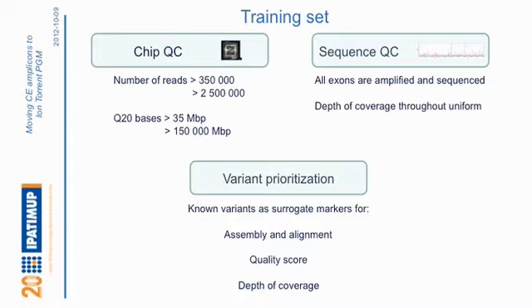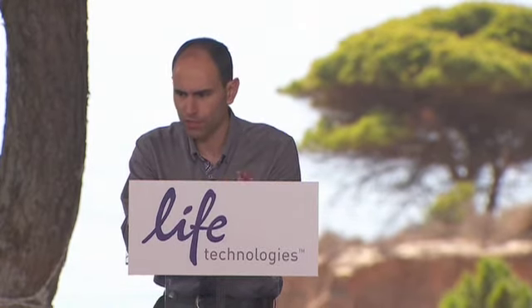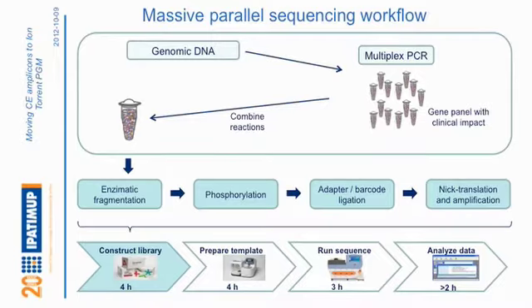Another aspect that was really important at this stage was that we were still optimizing our multiplex reactions for the Ion Torrent. So it was important for us, in all the runs, to check if we had coverage of all the amplicons that we had in our multiplexes. And if they were not present, then we would keep note of those and later on use Sanger sequencing to run those amplicons that were not covered.